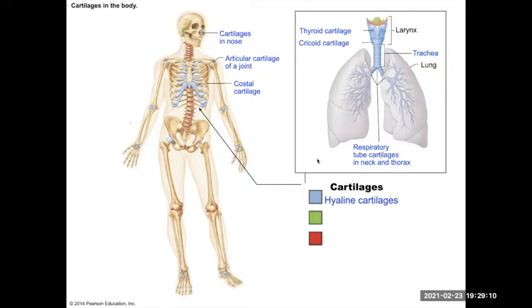histology wise, you only have to recognize cartilage is cartilage, this hyaline cartilage here, but it's broken down into 3 parts. The most common one is called hyaline cartilage. That is what is at the tips of your bones, at your joint surfaces, where the bones would be rubbing together in synovial joints.